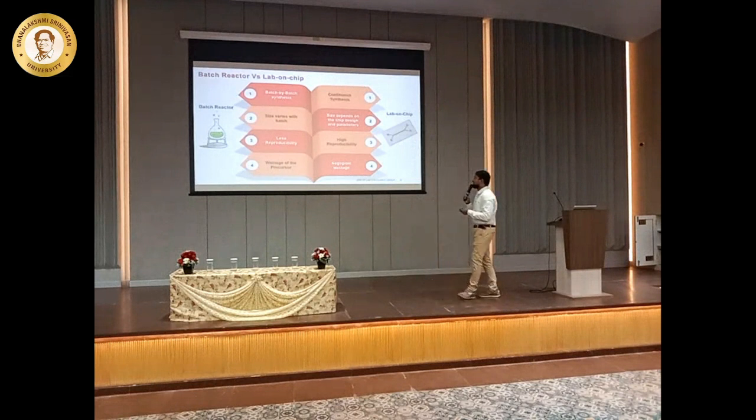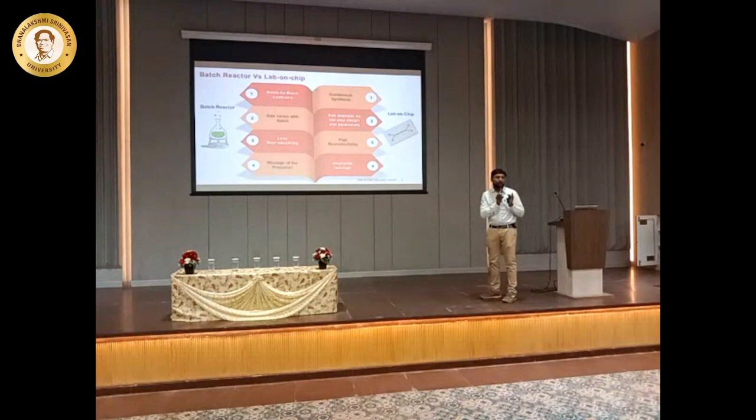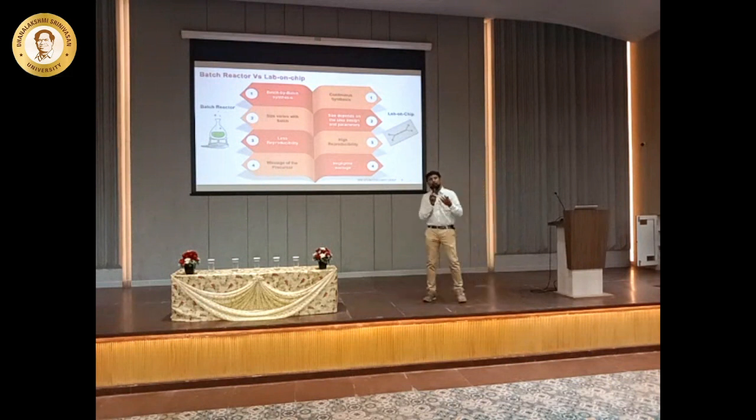So here we have, say, batch. Every time you need to take a beaker and then you need to stir it, you need to add, and the time, the amount of concentration you're going to add in the beaker, or the size of the beaker, either of these things will be problematic for us. Say for instance, someone would have developed a particle size, gold nanoparticles of 10 nanometer in a 100 ml beaker. If I ask him to do it in a 1 liter beaker, there might be a problem.